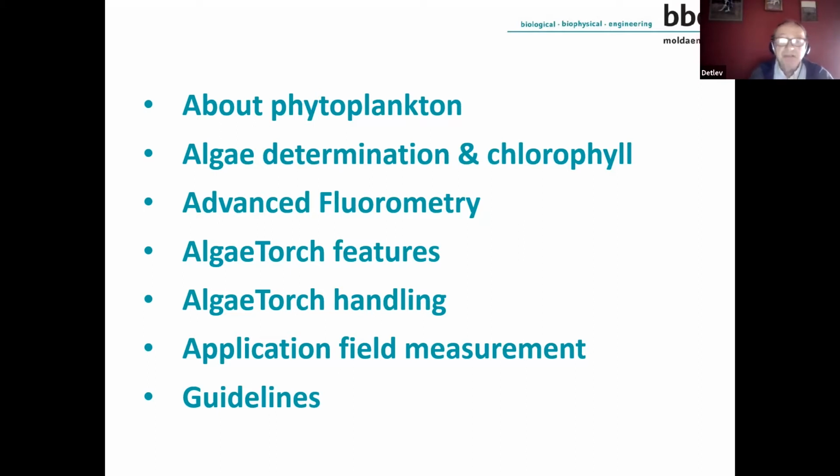Therefore, it might be interesting to determine these algae and get information about the amount. And this is the second point: I want to talk about algae determination and how to measure it. Then we have the advanced fluorometry, which uses a technique I want to introduce here. We have then the AlgaeTorch, this instrument.